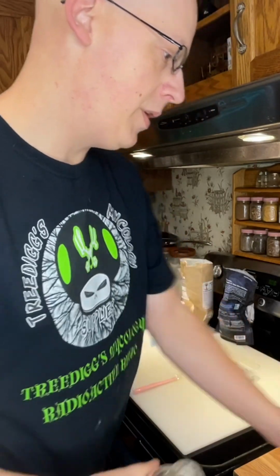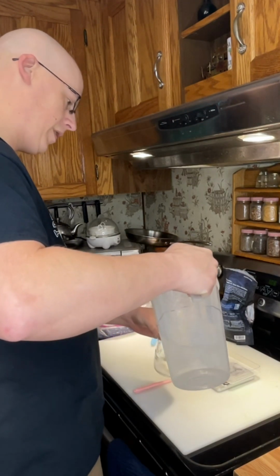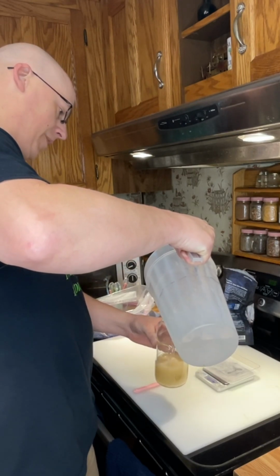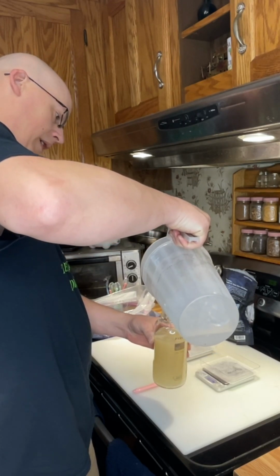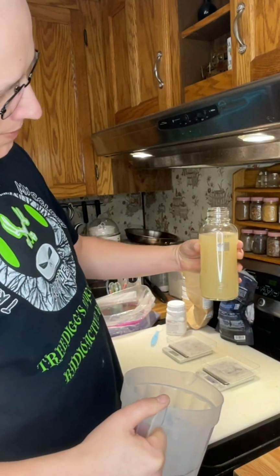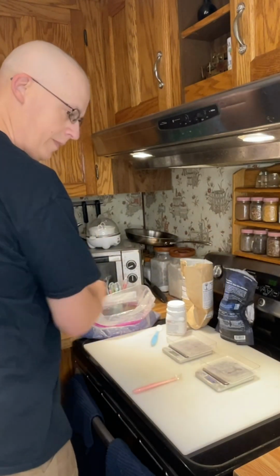Anyhow, so we'll set that one aside for a minute. It's obviously not ideal, but it will work. We'll get to filtering it out here. Now you'll see what will happen when we add the same cold liquid to regular agar. And as you can see, top of the little Pyrex mark is the 500 milliliter on that side.